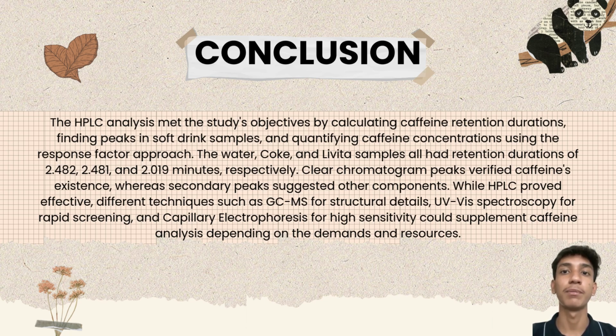While HPLC proved effective, different techniques such as GC-MS for structural details, UV-vis spectroscopy for rapid screening, and capillary electrophoresis for high sensitivity could supplement caffeine analysis depending on the demands and resources.